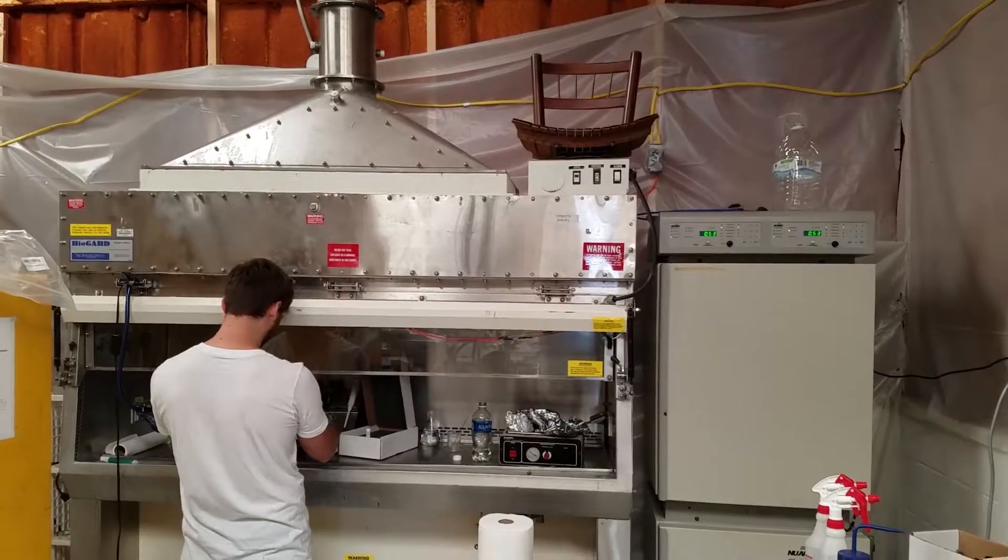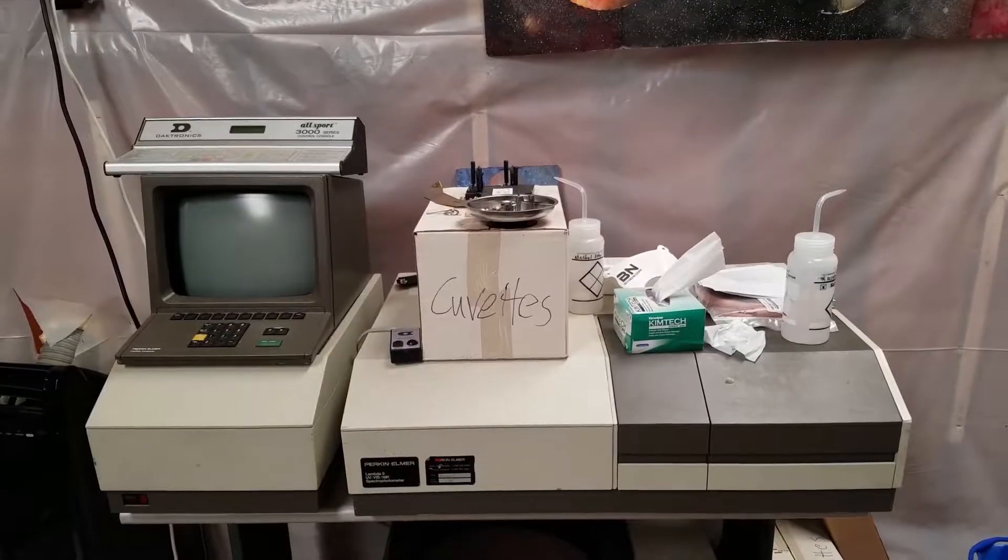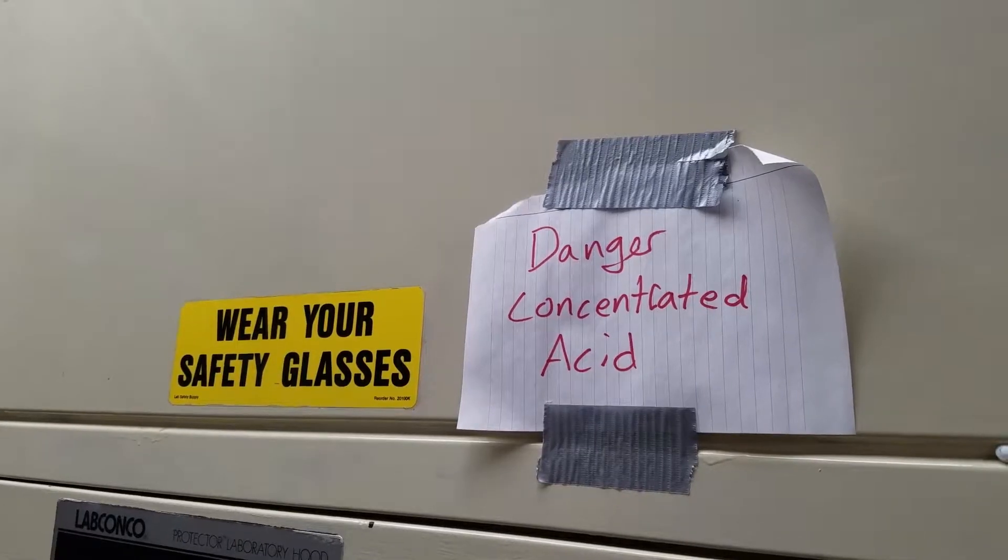Hey everyone. We are here at the Indy Lab, and right behind me are the petri dishes and the spores.